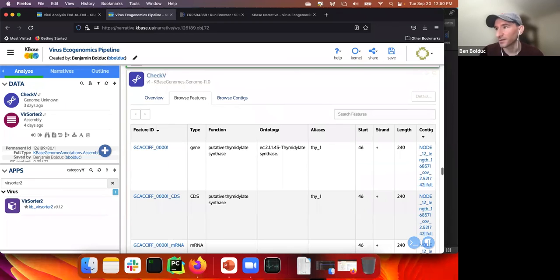And while that's loading, for viral groups to be included, the default options include all. No, for KBase, you need to add them. You'll have to click on each of the options, then click on the drop down and select that option, and then use the plus symbol to add a second one.